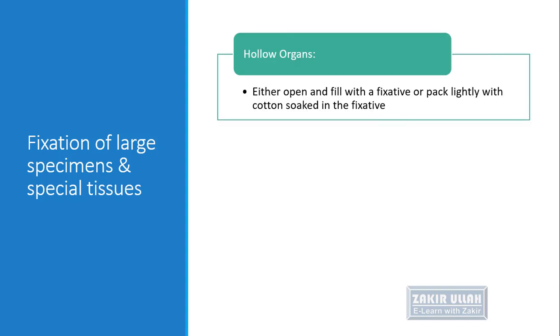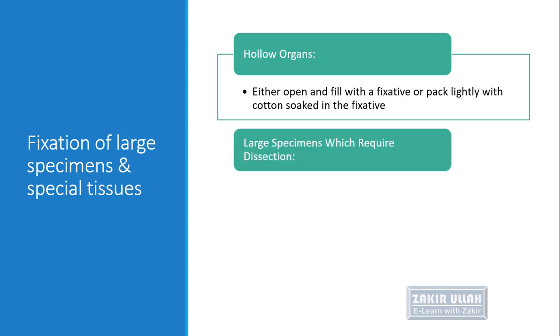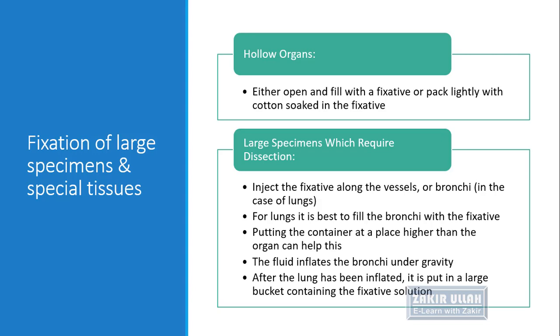Now, how to fix a hollow organ? After receiving hollow organs, either open the hollow organ from one end to the other end, or another method is to fill the hollow organ with a fixative or pack it lightly with cotton soaked in the fixative. Then there are large specimens which require dissection.